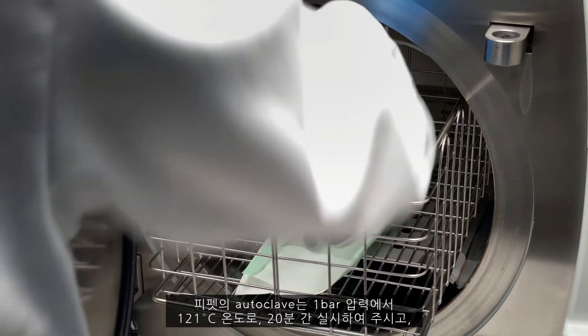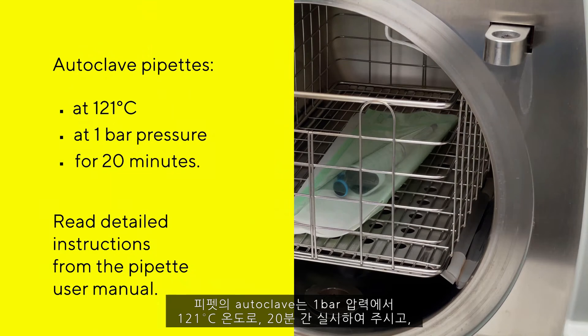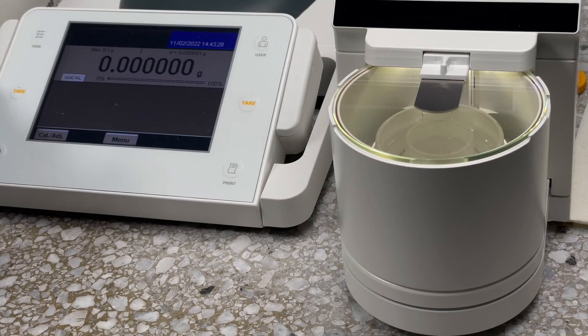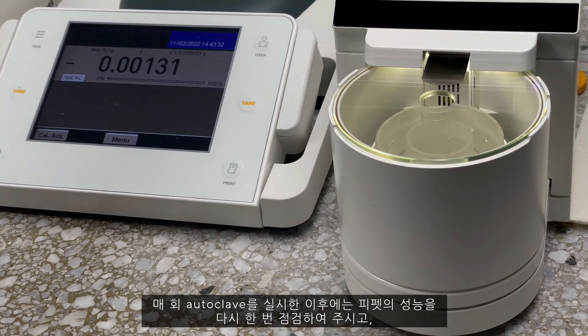Autoclave pipettes at 121 degrees Celsius at 1 bar pressure for 20 minutes. Read detailed instructions from the pipette user manual. It is recommended to check the performance of the pipette after every autoclaving.